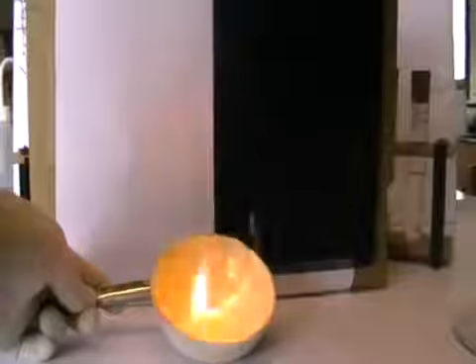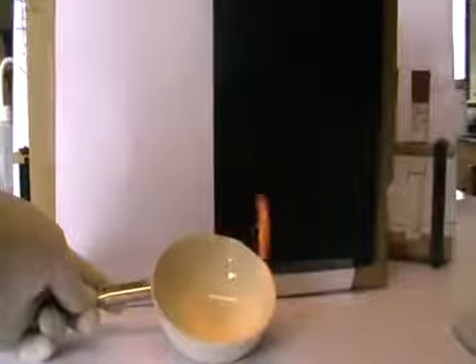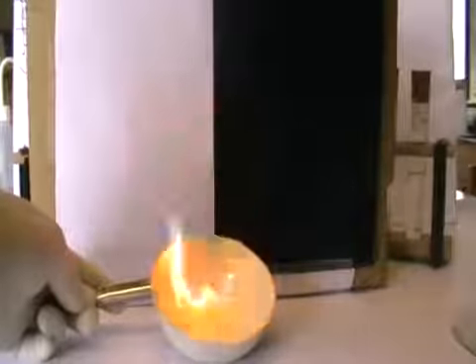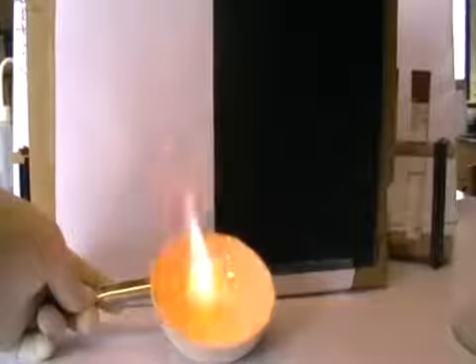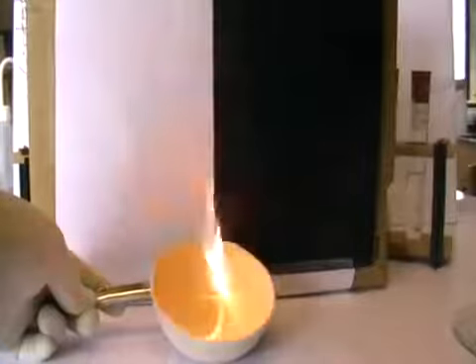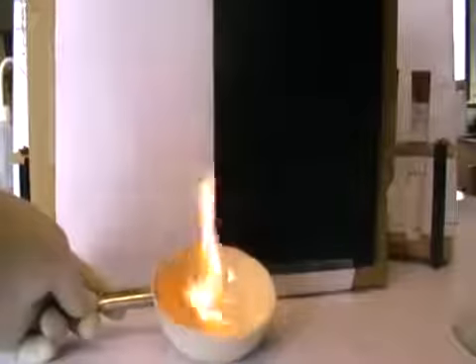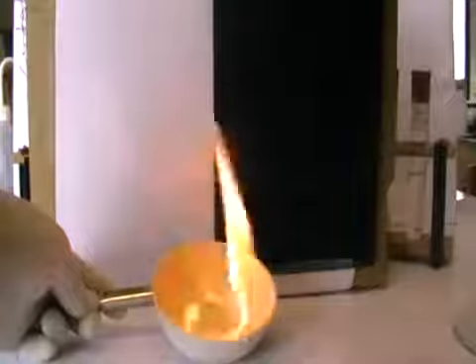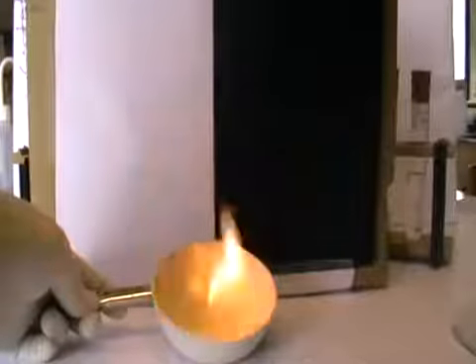Ethyl ethanoate, of course, has its own built-in oxygen there, CH3COOC2H5. That helps it to burn. And again, like ethanol, it's burning with a clean flame. Not seeing much evidence there of any black smoke. Perhaps a little blackening of the dish around the top there. Just a little bit more soot therefore than in the case of ethanol.